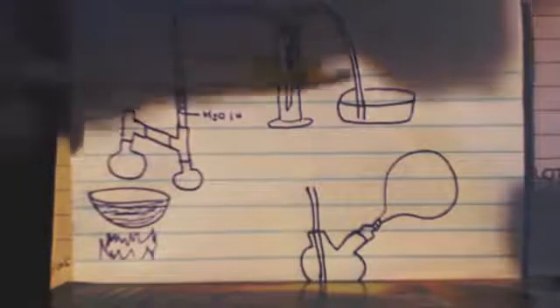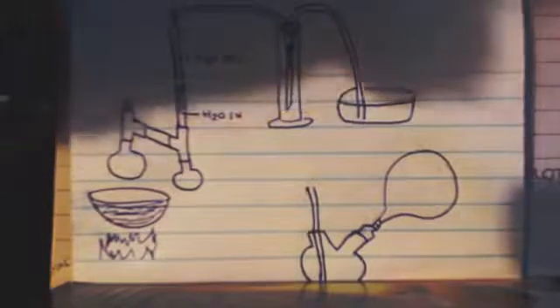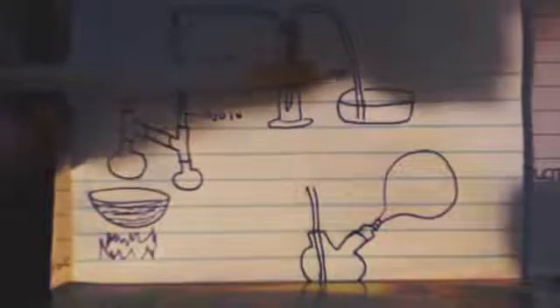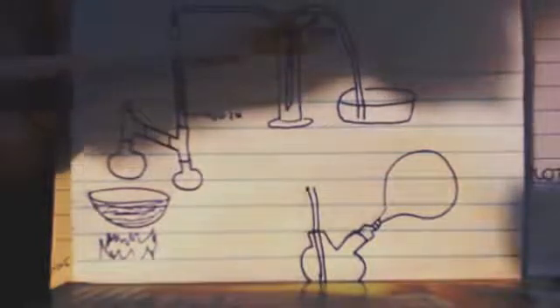Another way you can do this is always have a suck-back trap - when this comes out you want to have a suck-back trap in case this gets sucked back, it won't get sucked back into here. I didn't draw it because it's an obvious thing. It should be on every type of distillation setup like this.